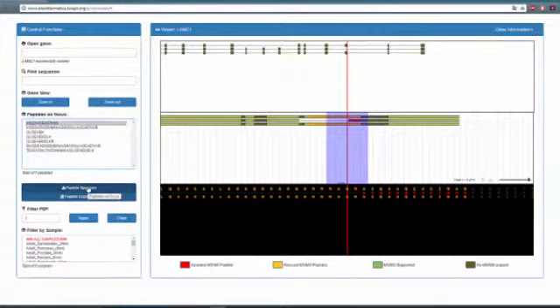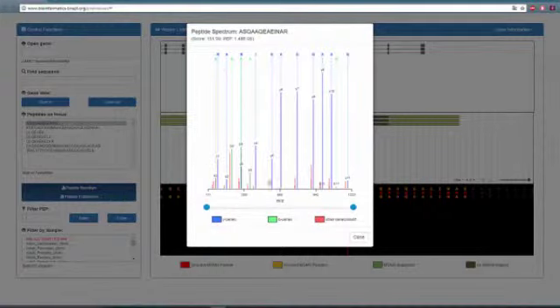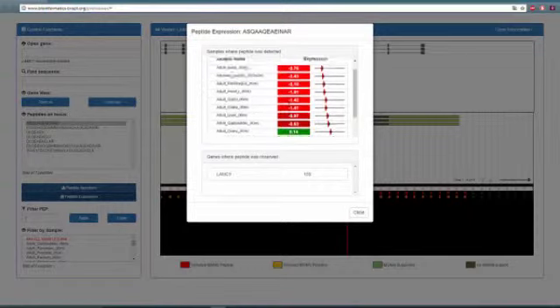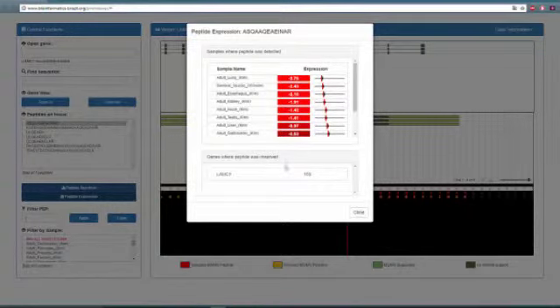Even if you don't understand the spectra annotation, you can still see that it has a very good score and a very low error probability. You can see that the quality of the identification is good. Also, importantly, you can see in which data sets that peptide is present, and at which levels it was detected by the instrumentation. You can also see that the peptide in question does not align to other sequences on the genome, so it only aligns to the gene that you are analyzing. Of course, this gives you extra confidence in the identification you performed.